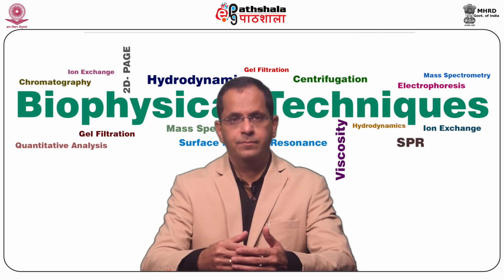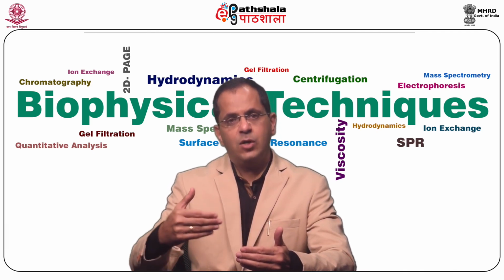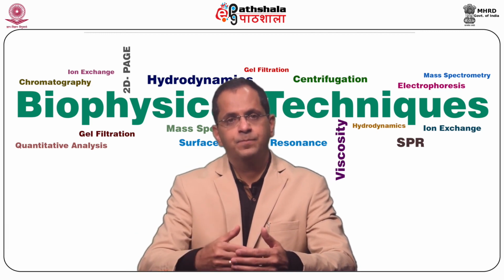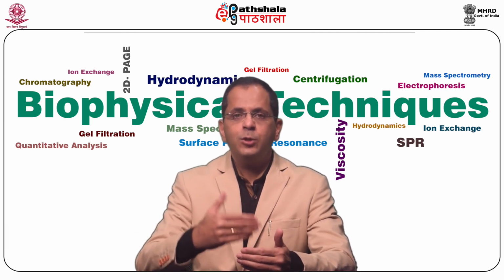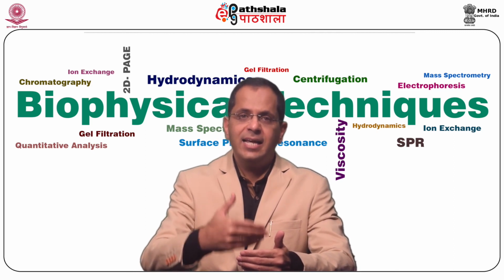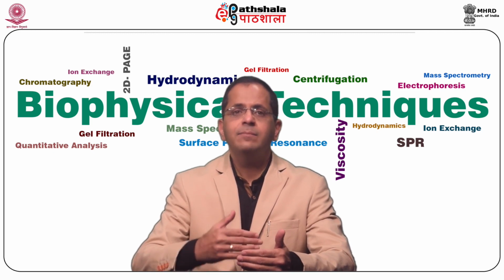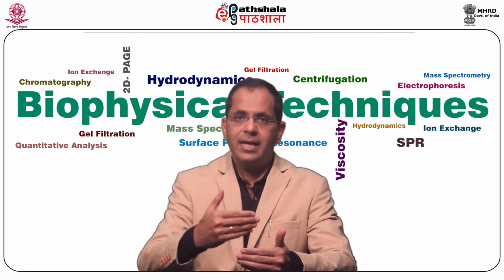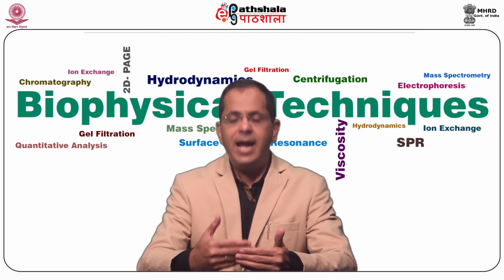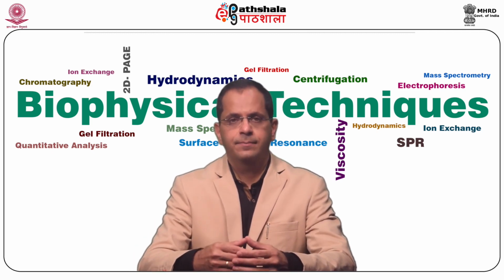Disadvantages. Replicate dependence makes it very difficult. There is susceptibility to errors due to parallel sample processing and analytical variability. It becomes mandatory to carry out sample preparation and MS data acquisition cautiously.